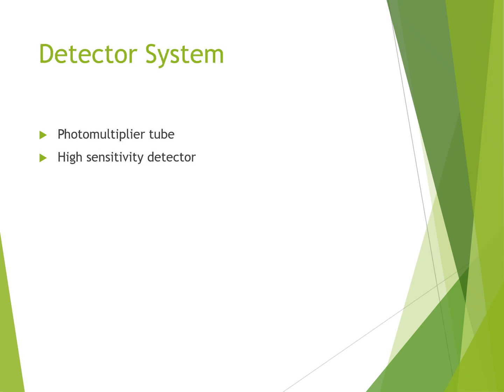Detector systems comprise photomultiplier tubes, which are used due to their extremely high sensitivity.